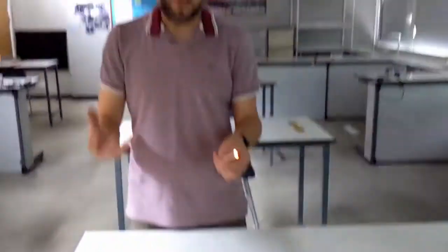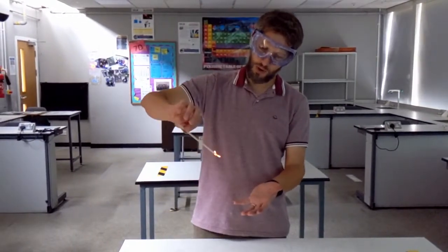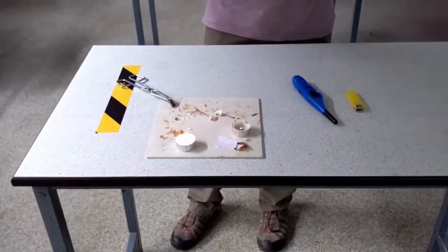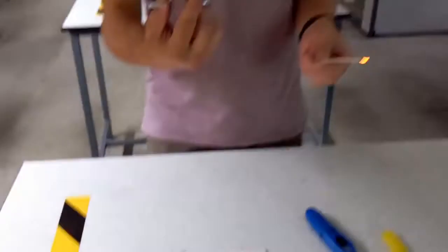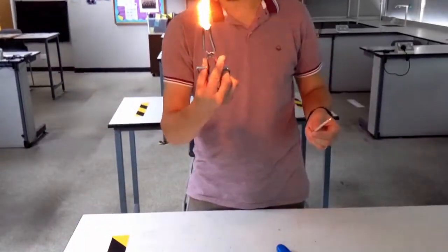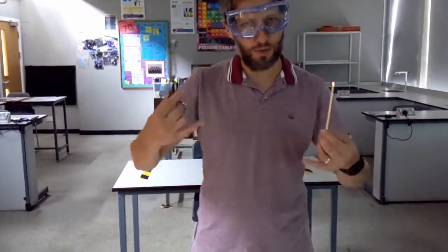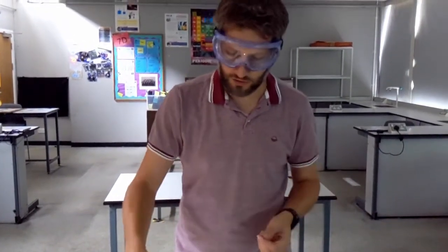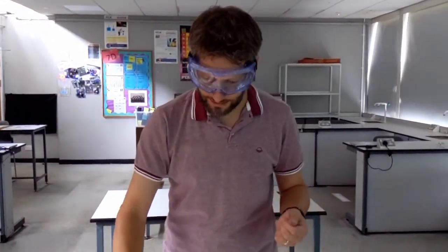Now, some fuels will burn more vigorously than others. So wood, it's burning fairly slowly. The paper burned okay. But if we get a fuel that burns more vigorously, we can impregnate it, we can soak it into something. So this is a bit of a fire lighter. What you'll see is, as soon as we light that, we get a very big flame. Immediately it catches fire with a big flame because that fuel that it's containing burns quite vigorously. It gives out a lot of energy when it's burning and a lot of heat.